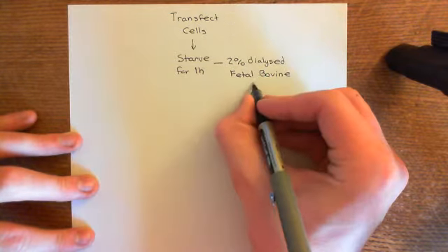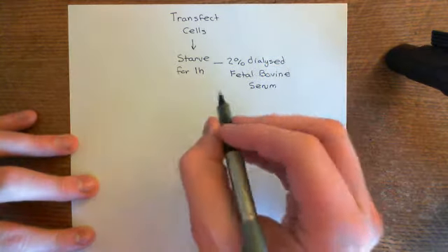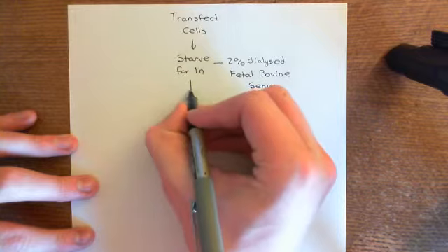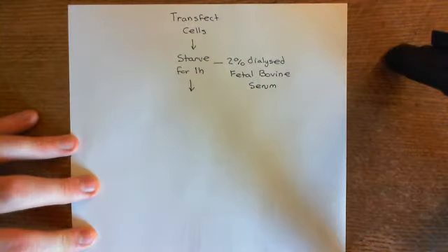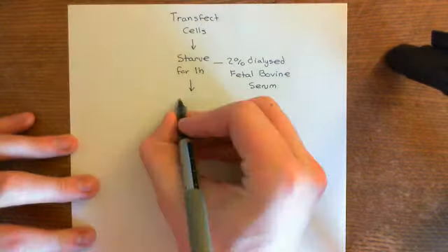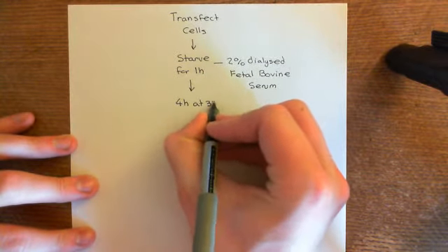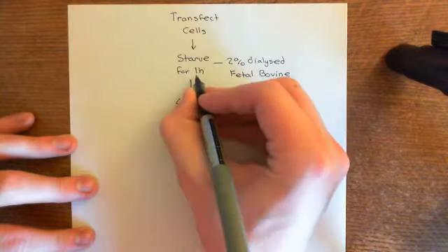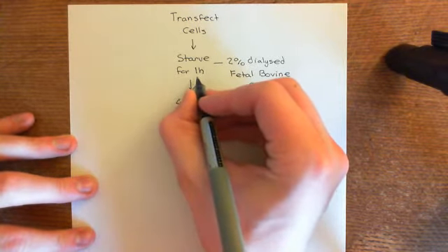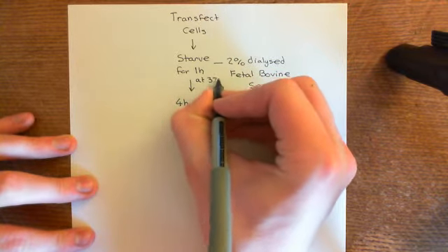Now once they have lasted for an hour, so they've run out of palmitic acid, what you're then going to do is add to their medium tritiated palmitic acid, which has a certain level of radioactivity. I should have also stated that the starvation process, which you do for an hour, will be at 37 degrees Celsius.